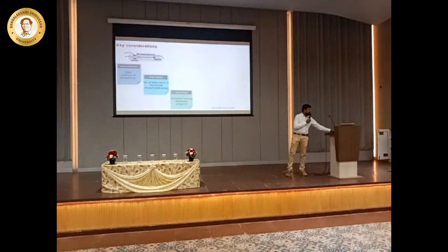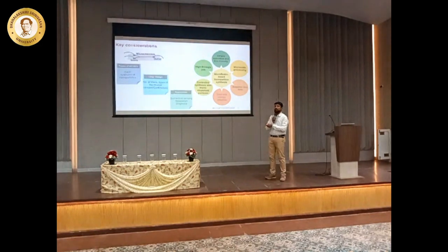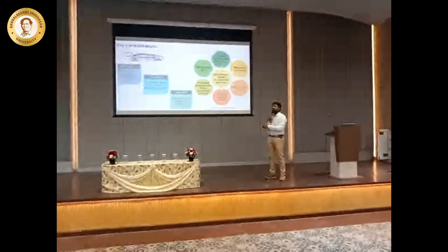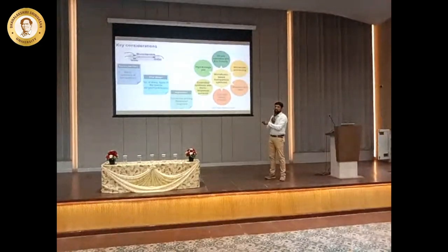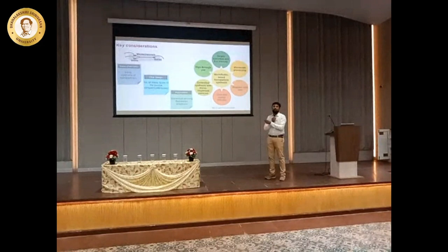So some of the key considerations we need to have: one is you need to know what the precursors are that you need. You need to know the basic synthesis and what the design is, how you want to make this, how much the flow rate has to be. All of these have to be considered, and for what application we're going to use. So these are the 3 major considerations we need to look at. A basic microfluidic device will have some inlets, an outlet, and some reaction chamber, and this can be used for making these nanostructures.